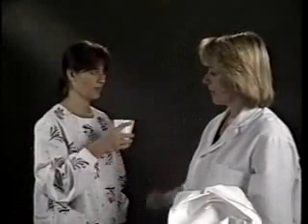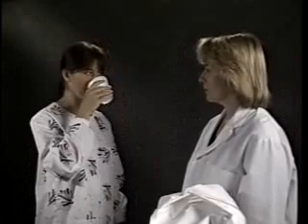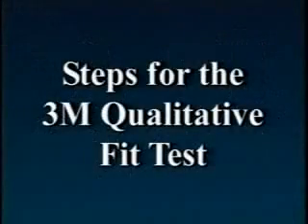Remove the test hood from the subject. Give the subject a few minutes to clear the taste from their mouth. Rinsing the mouth with water may help clear the taste. You are now ready to conduct the 3M qualitative fit test.